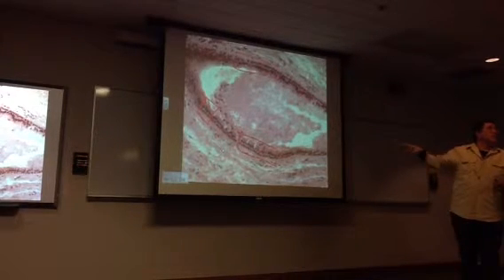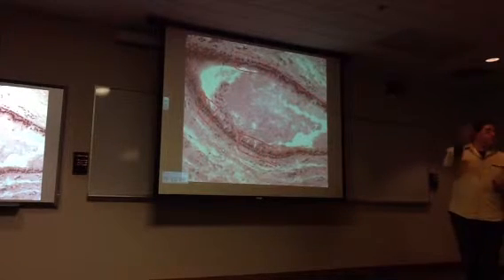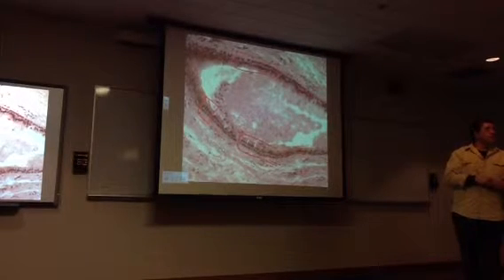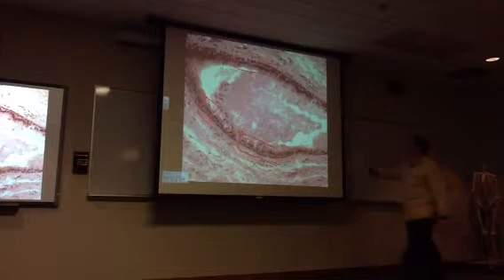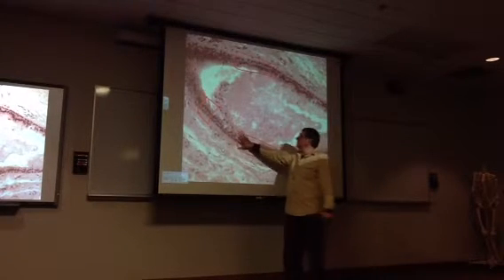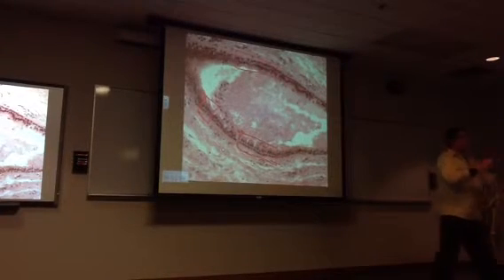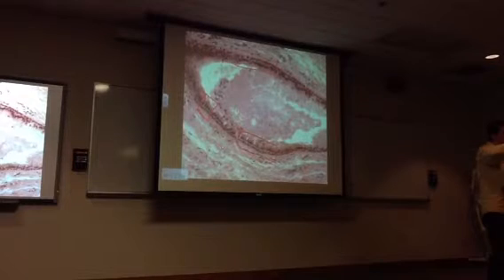Larger excretory ducts are going to go from a stratified cuboidal to a stratified columnar. So some of the times when you're making a judgment call on a glass slide, you've got to look around and get a general impression of what the majority of the cells look like on the surface layer. Because again, remember, plane of section could influence what the cells look like.